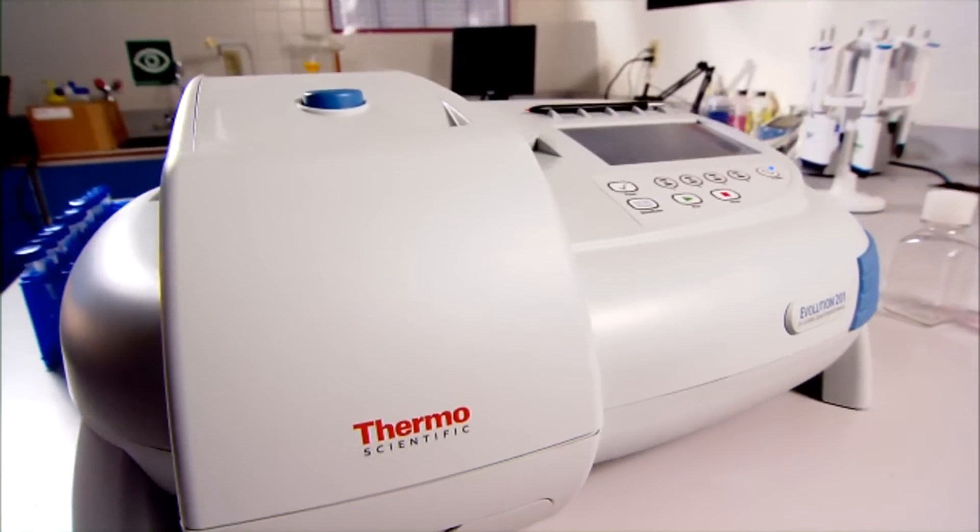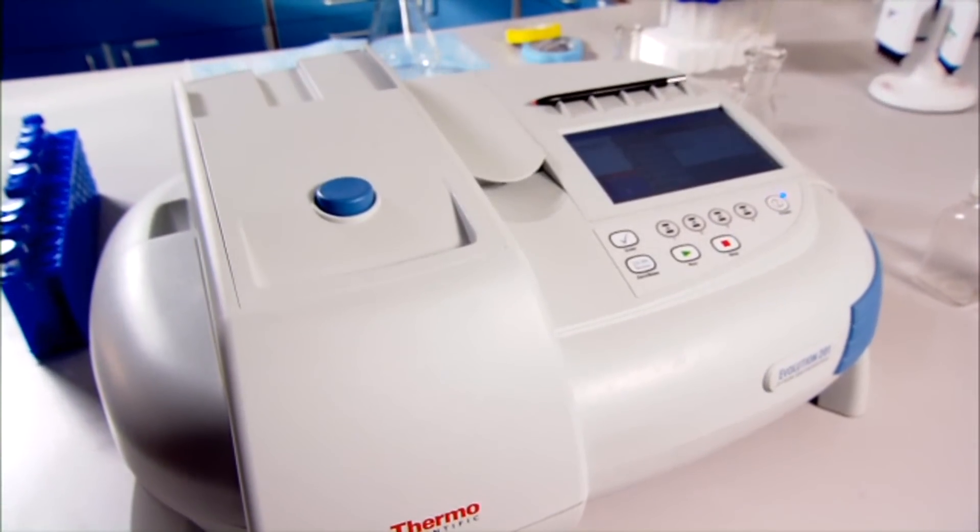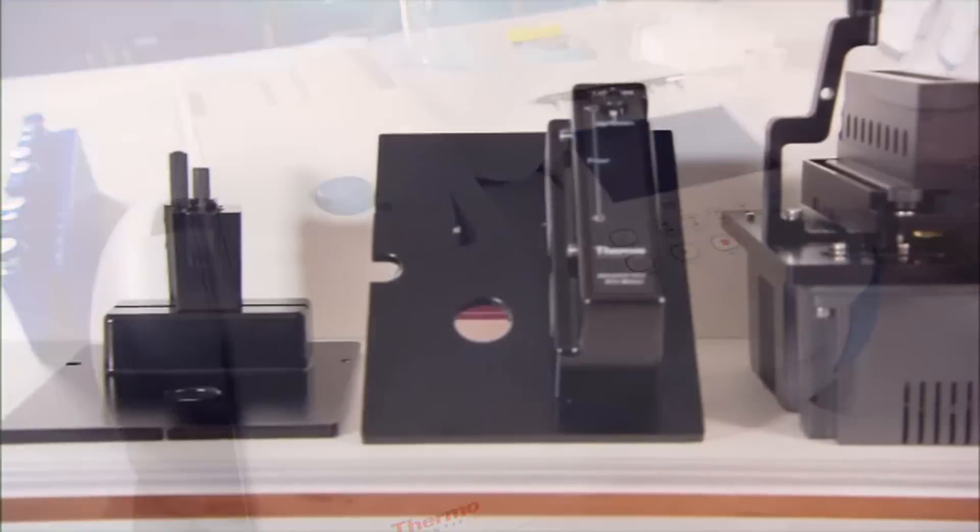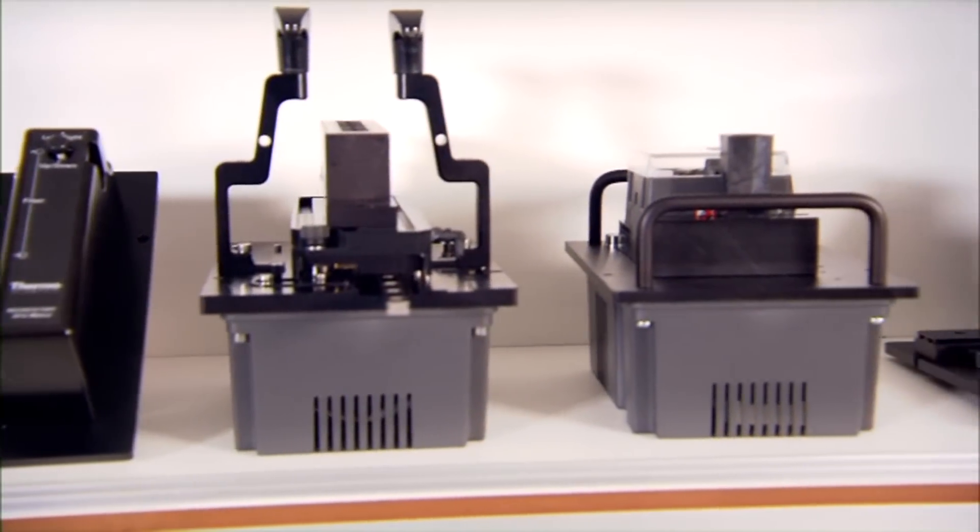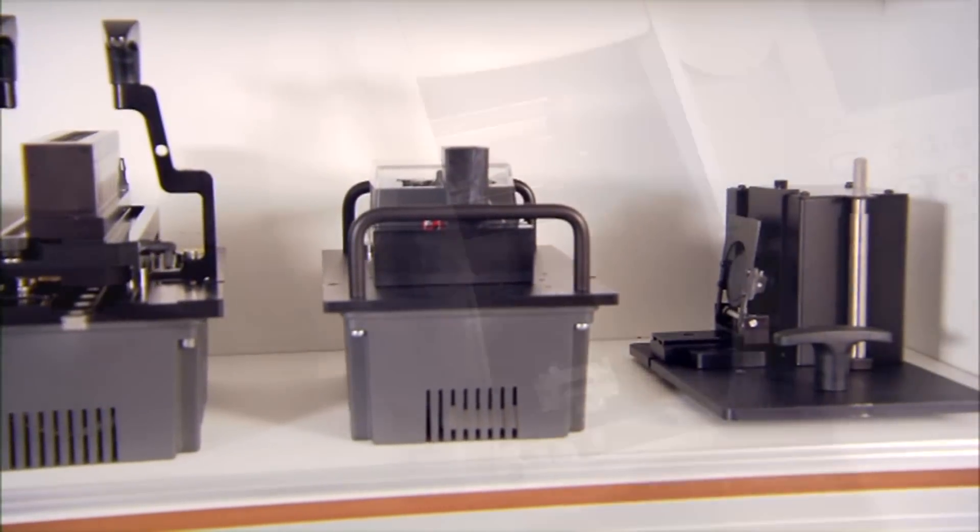In fact the Evolution 200 Series offers unrivaled features and performance with a large room light resistant sample compartment to accommodate a full range of accessories and sample types.